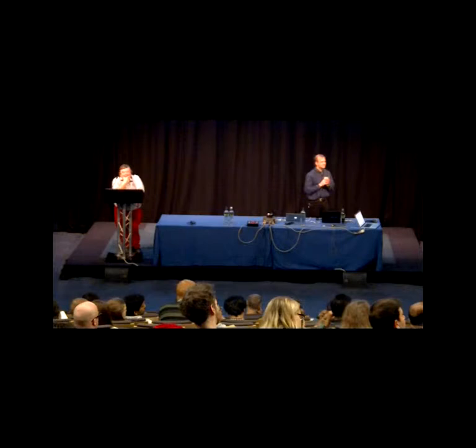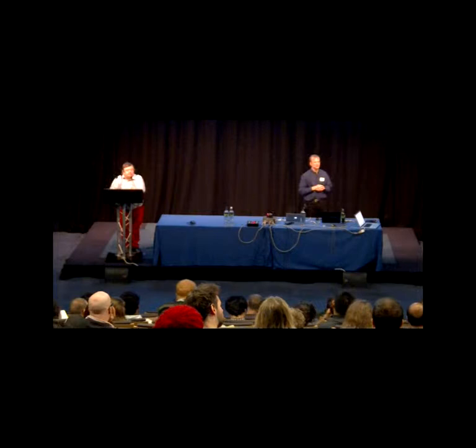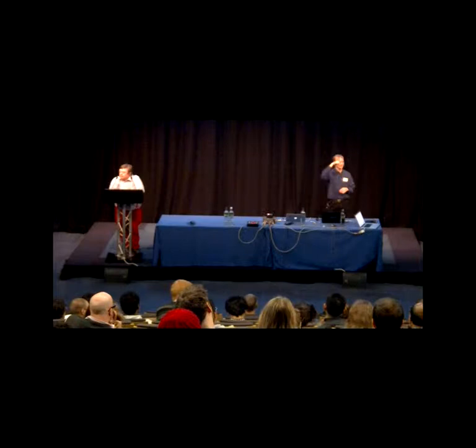Ben Bax, GlaxoSmithKline. My question was related to that. Sometimes you see a helix that looks like it's rotated in a low-resolution structure when you're doing these molecular placements. And it seems like you wouldn't really get a helix rotation very well with your morphing method. Well, it depends on how low the resolution is, whether this would work very well. Basically, by translation of the helix along the axis, you effectively get the rotation, except the location of all your C alphas is a little bit different. So in part you get that, but that's a valid point.